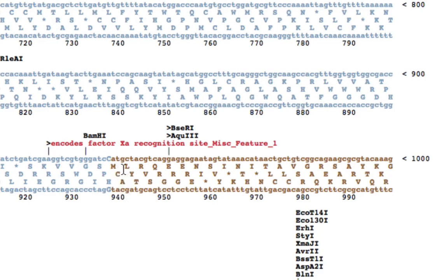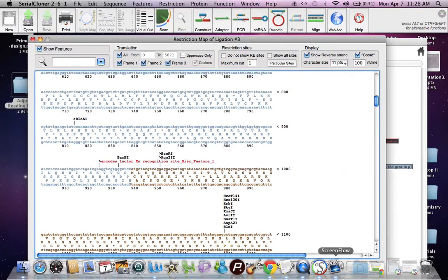Then instead of A we'll have methionine in the third reading frame, and the entire sequence will be rectified. So how do we push AT into the right place? All we need to do is insert 2 nucleotides between C and A, C in blue and A in brown. That way A and T would be pushed by 2 nucleotides, thereby in the third reading frame the sequence would start with ATG and code for methionine.